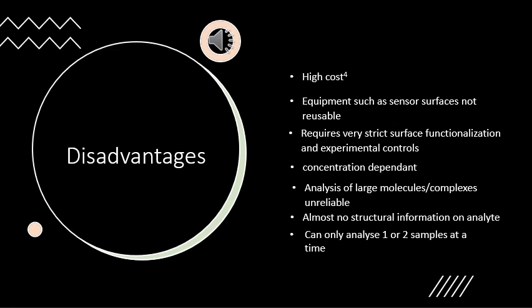All in all, this is a highly specialized method that has many uses in its specific field. However, its versatility as a whole in all of chemistry falls a bit short when compared to another technique such as IR.